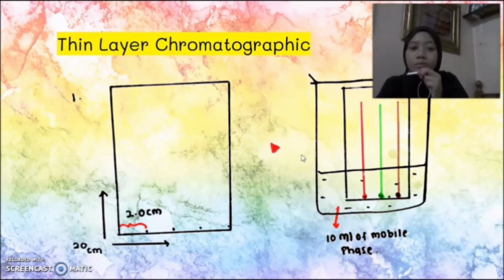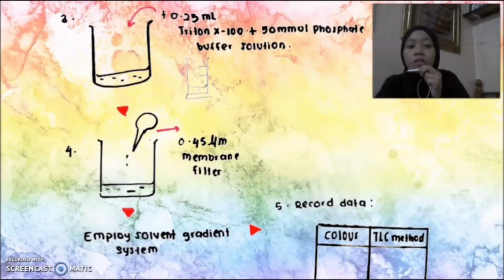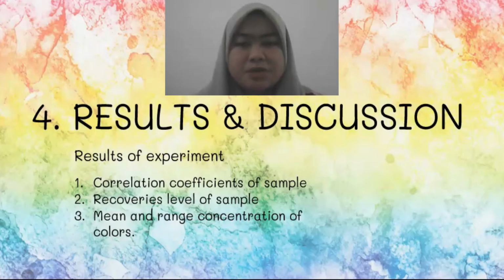Next, okay, this is the third step, which is liquid chromatography analysis. This is the full system that we employ, a solvent gradient system. Next, we move to the result and discussion.